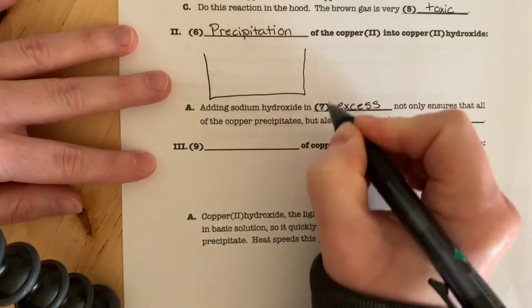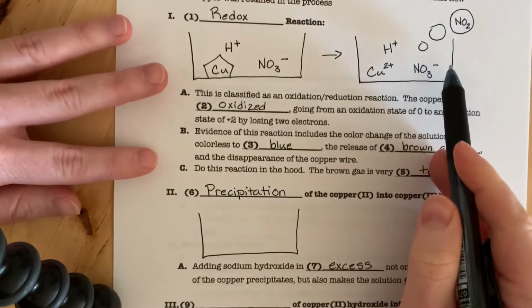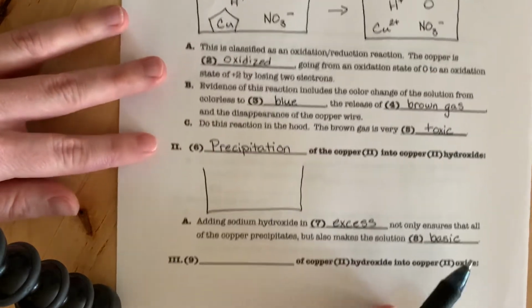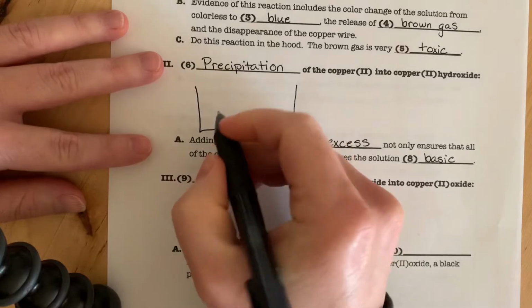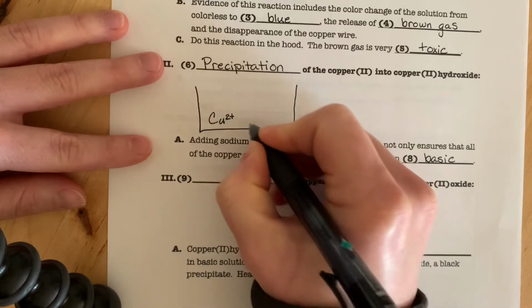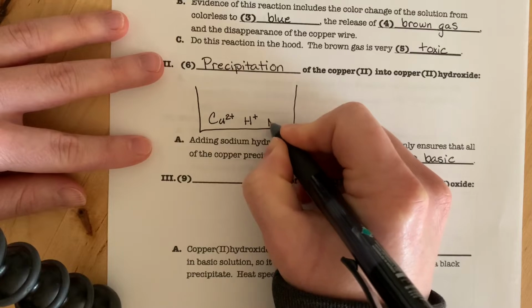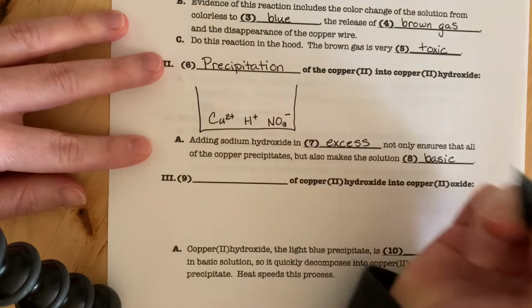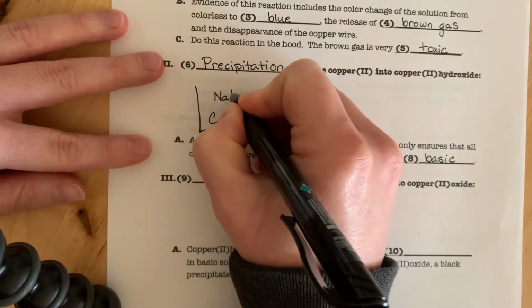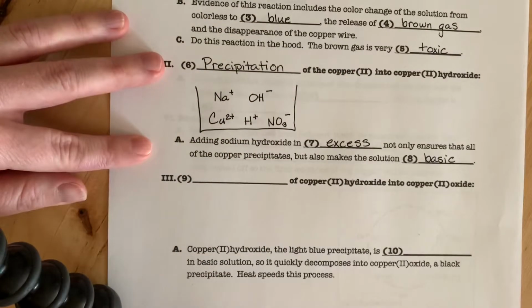So let's draw our before picture. And that contains everything that we had up here. Everything in the after picture from the previous reaction is going to still be in there. So I've got my copper 2+, I've got my H+, and I've got my NO3-. And additionally, what I've added is some Na+ and some OH- from the sodium hydroxide.